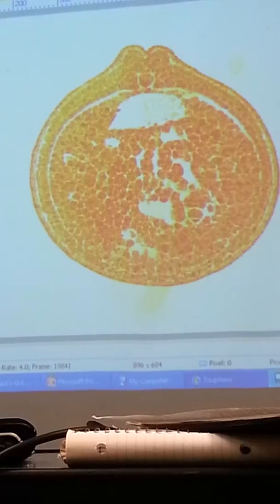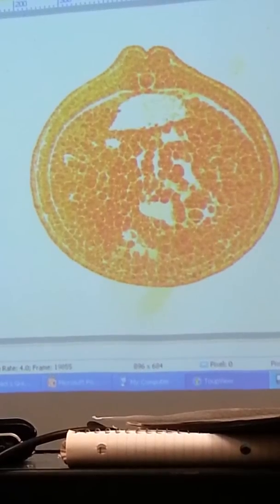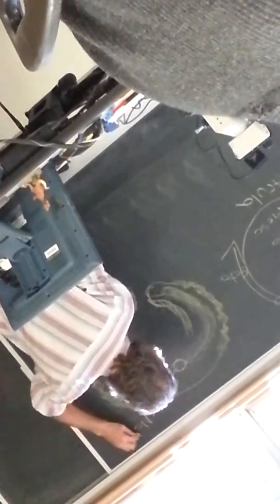So here is mesoderm, coming up, mesoderm coming up. There's endoderm and endoderm here. Mesoderm, and then ectoderm. Clearly I have my 3 germ layers. Endo, meso, ecto. I have the beginning of a notochord.